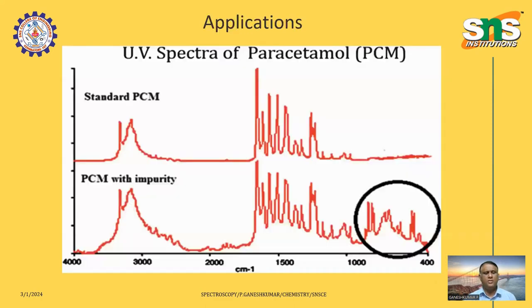Now, in the application part, just observe these two spectra. The top one is a standard PCM, that is paracetamol, and the bottom one is paracetamol with impurity.